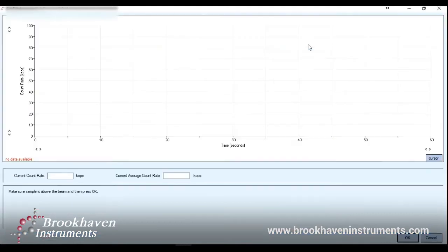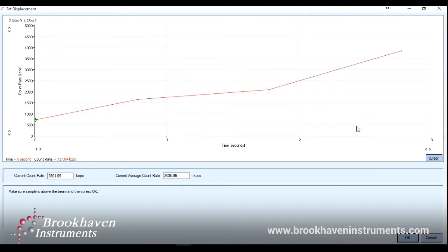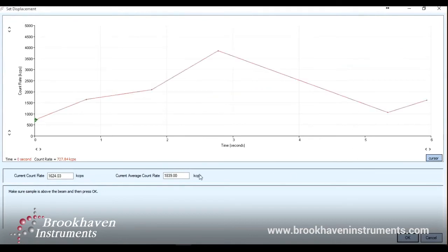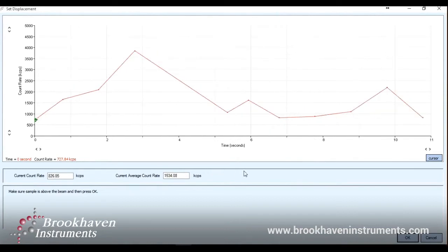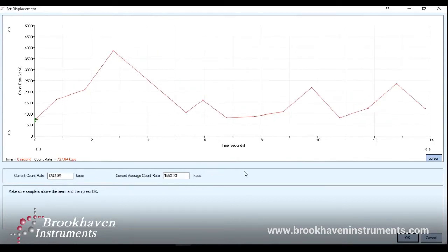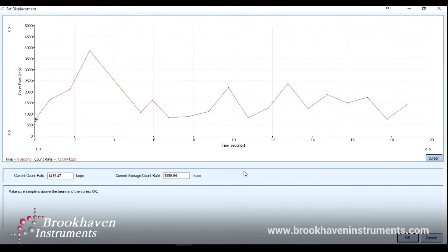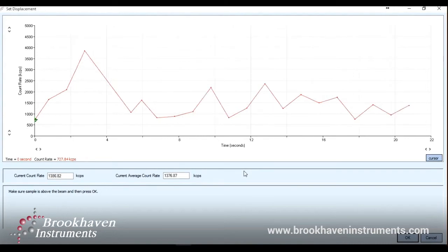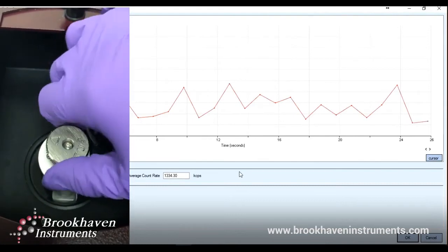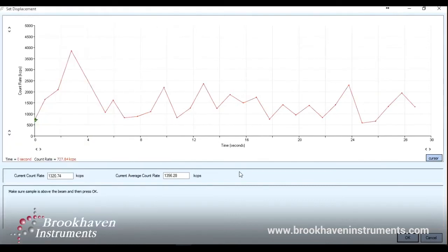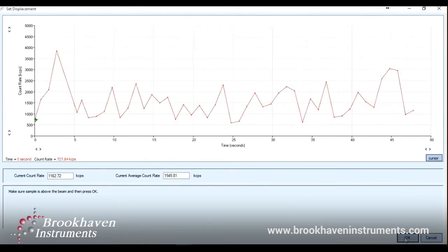The first task is to find a zero point. What that means is we want to find when the surface is just at the trajectory of the laser beam inside of the instrument, where it's halfway blocking its path. To do so, we follow the on-screen instructions that tell us first to make sure the sample is fully above the laser path. We can then turn the wheel clockwise a few turns to make sure. Let this count rate stabilize for at least one minute so a reliable average count rate is obtained.